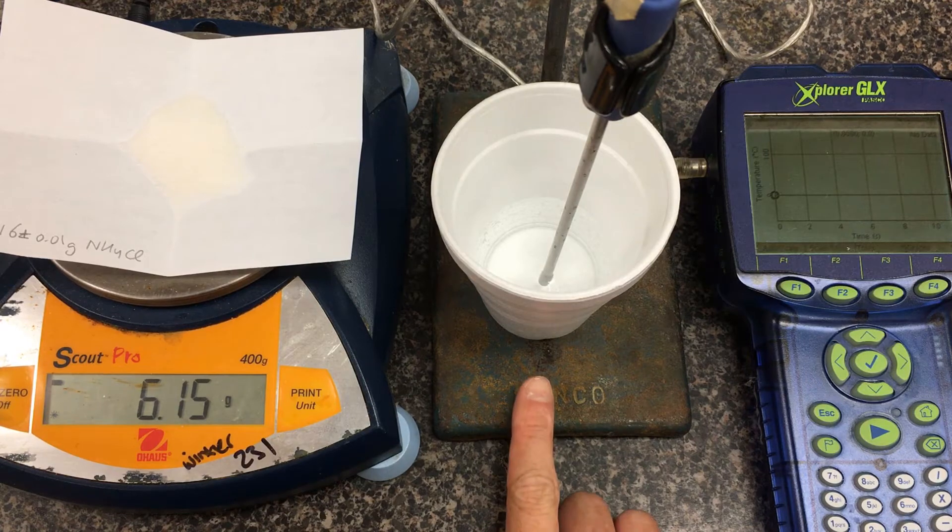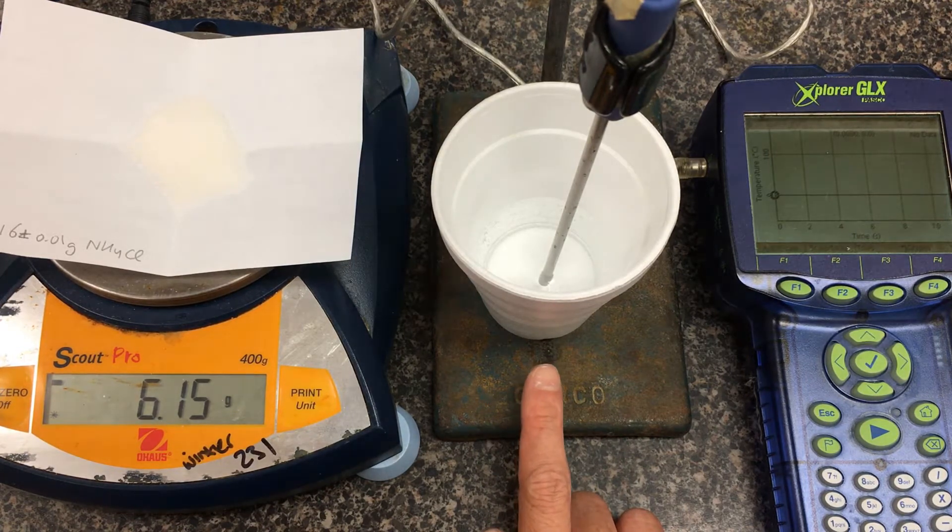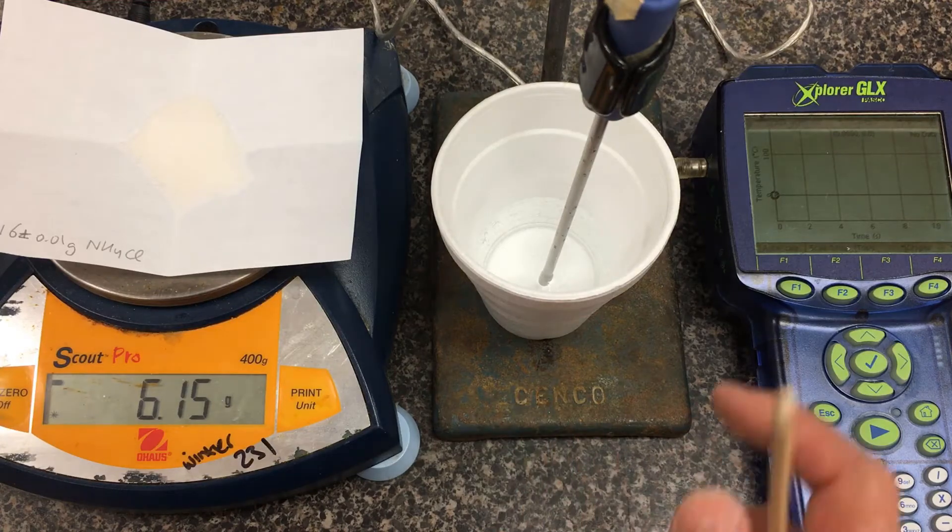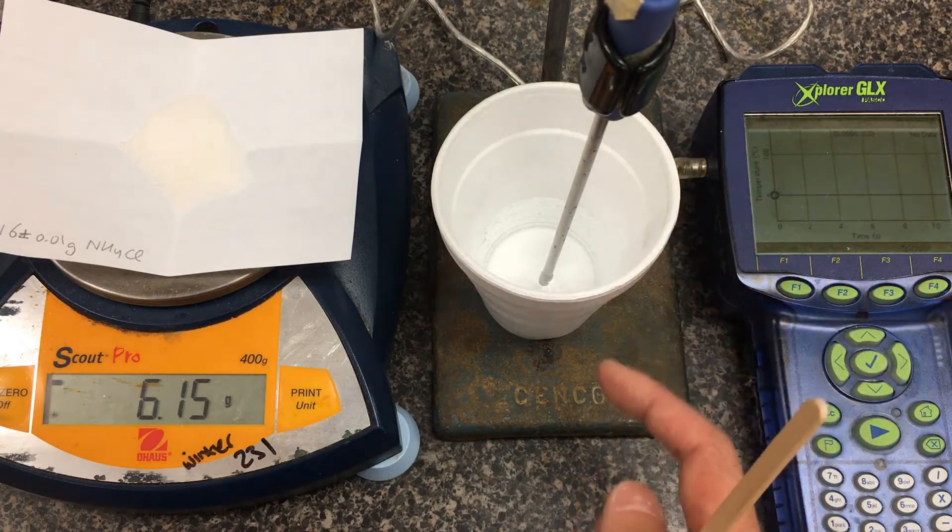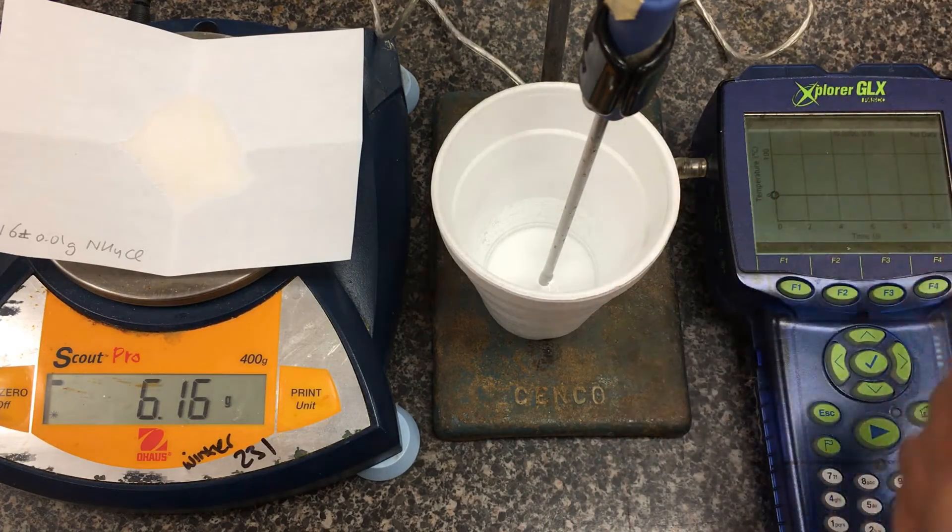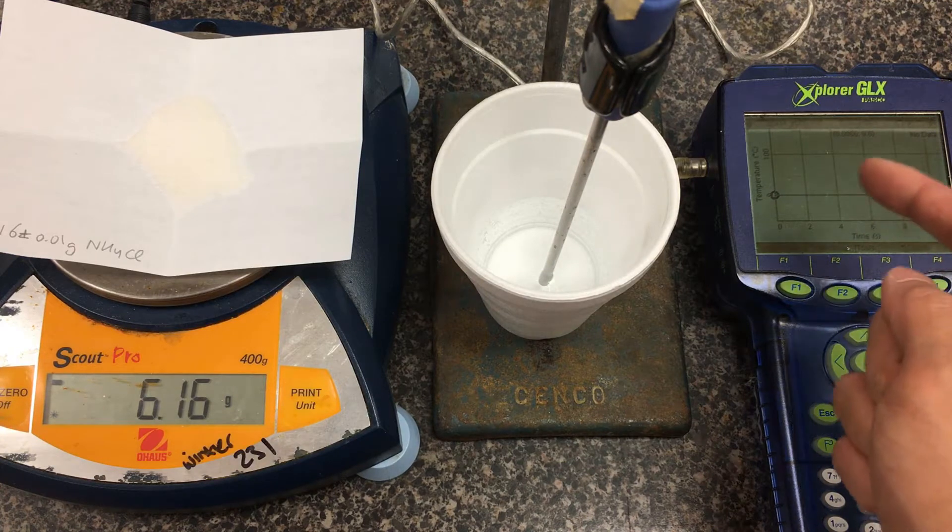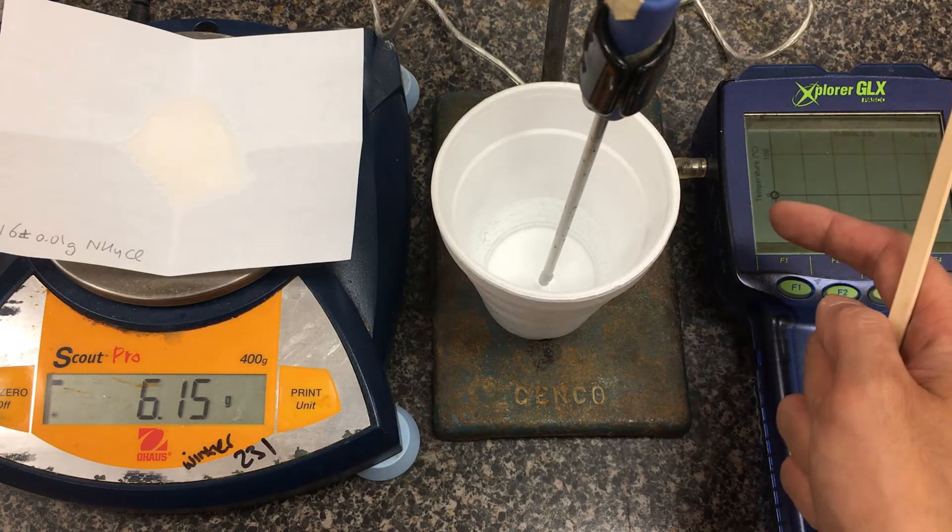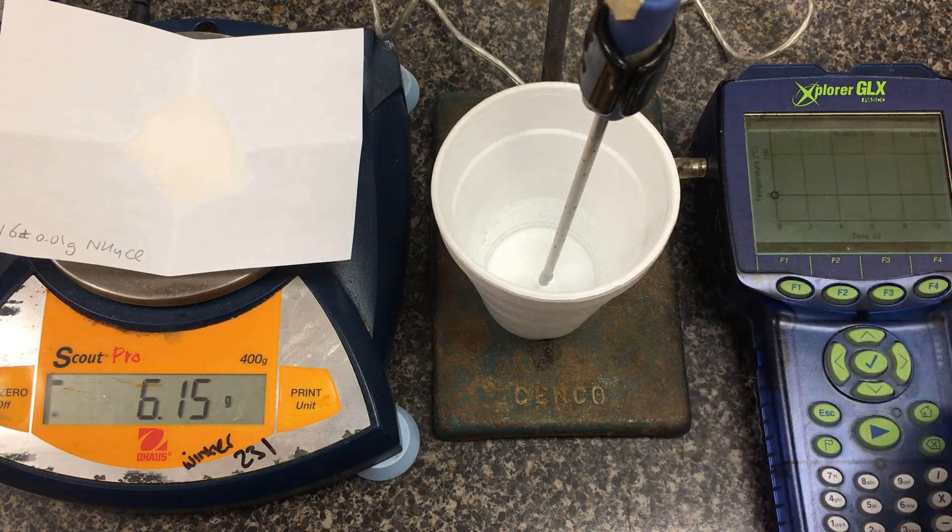We're going to be dissolving this powder into 50.0 milliliters plus or minus 0.5 milliliters of water. Standing here is a metal temperature probe hooked up to a GLX sensor. Our GLX device can sample the temperature in real time, plotting as a graph for us.